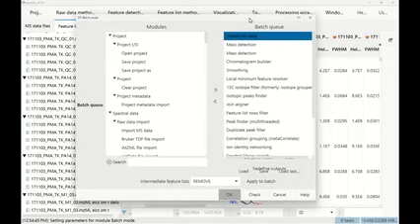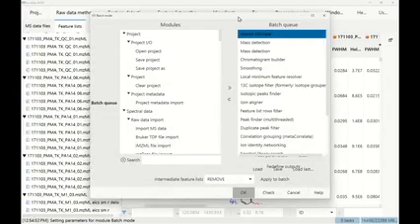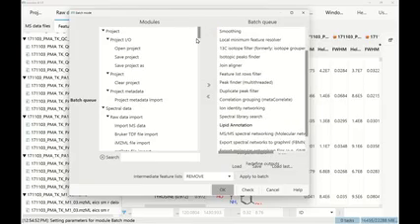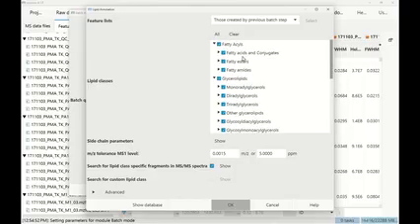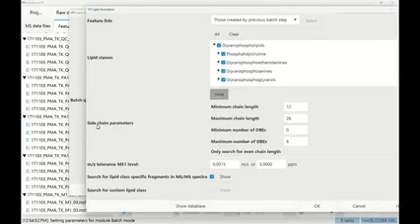So this is always where you go back to. If you want to optimize something or change something, you go to the batch mode. And this is actually where all the parameters are set up. So the wizard is only a surface where we give you a few parameters, and then this is actually where the processing happens. And in lipid annotation, you can then activate different sphingolipids, sterols, and other classes, and you can basically select the different classes that you want and also provide your own classes. And there are also some sidechain parameters, so you can limit the length of the side chains and the number of double bonds and those kinds of things. And there's some documentation for it.